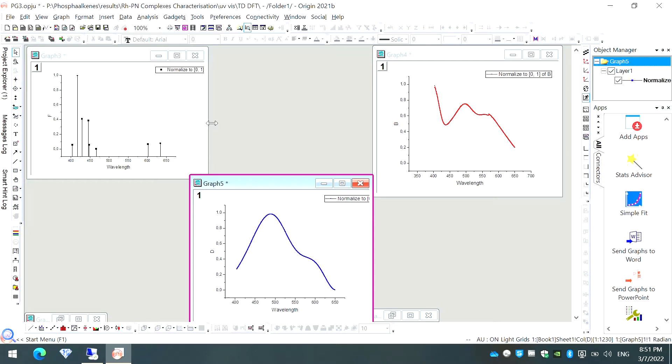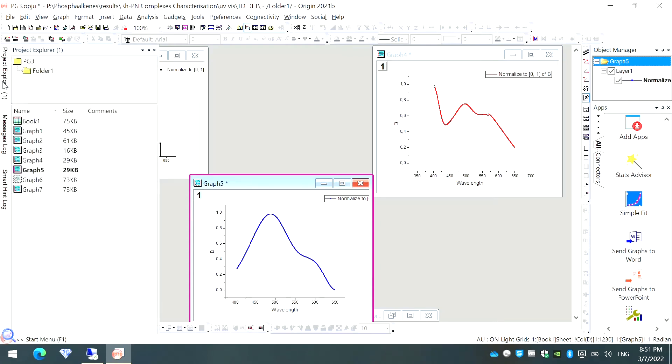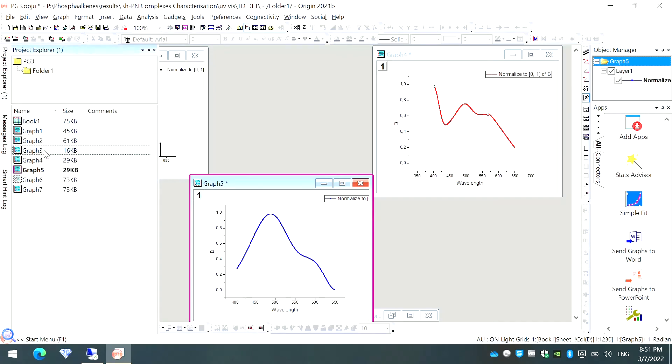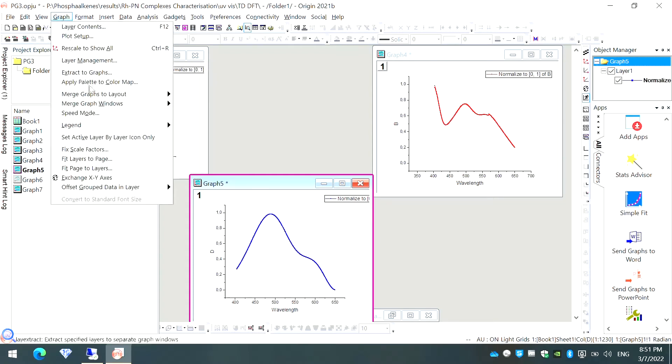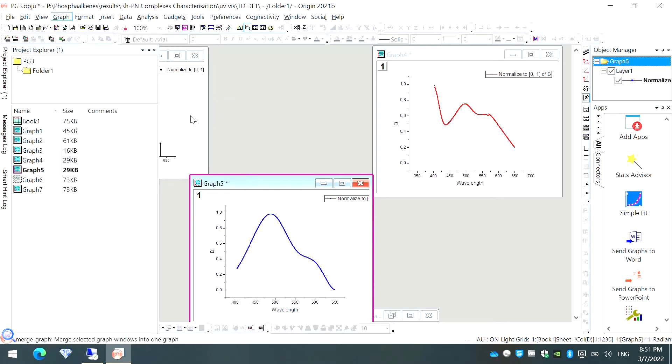For example, I have taken here these three graphs, graph number 3, 4, and 5. If I want to merge them in one single sheet, I want to take these all in one single sheet. First, I'll select these three graphs here, graph number 3, 4, and 5. Then we'll go to this option called Graph and then we'll click on Merge Graph Windows and then go to Open Dialog.